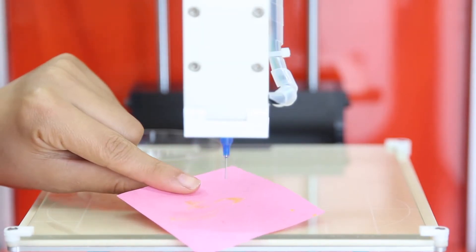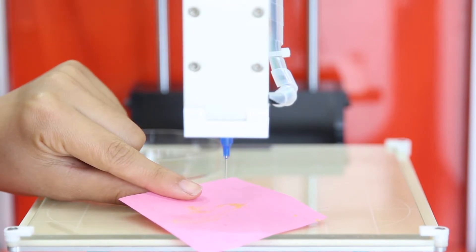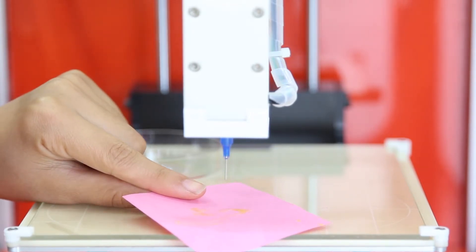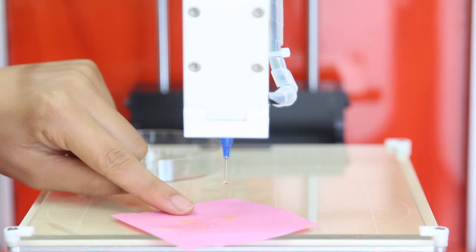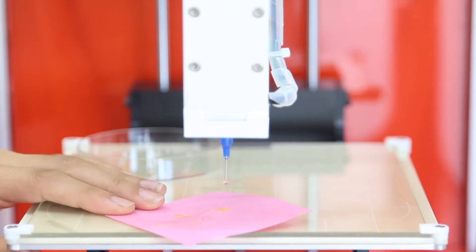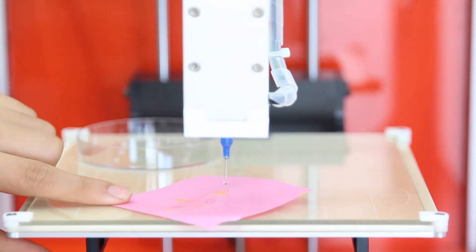Once you have done this, insert the extruder clips, prime the syringe by extruding until you find a bit of material coming out, and set the Z0 position for this next syringe.